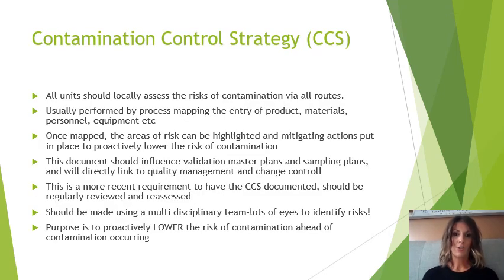So contamination control strategy. This is quite a new topic, and it's a very current topic to be discussing. All units should be locally assessing the risks of contamination via all routes into your clean room. So you're looking at your final product and working your way back.